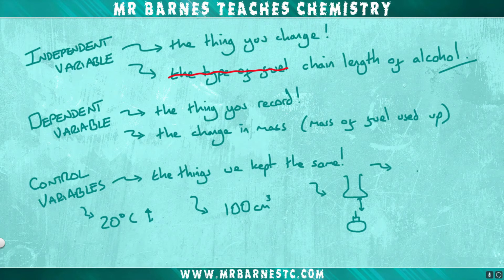Then the other control variable that you should have is the same amount of insulation. In my investigation, there was no insulation, so the heat could have been lost through the lid as well as through the sides of the conical flask. We could add a lid and we could add insulation around the side to prevent this heat loss, but because we kept it the same each time, we can still say that this was a control.